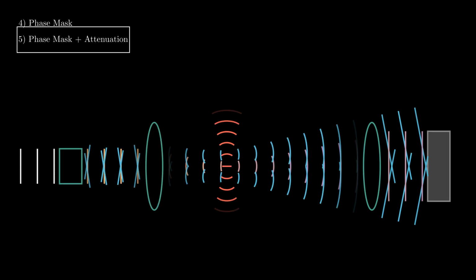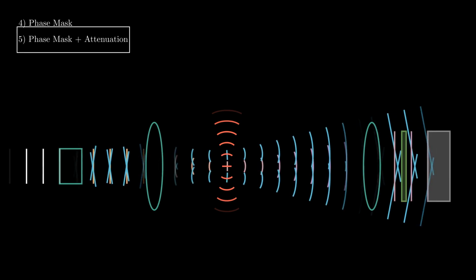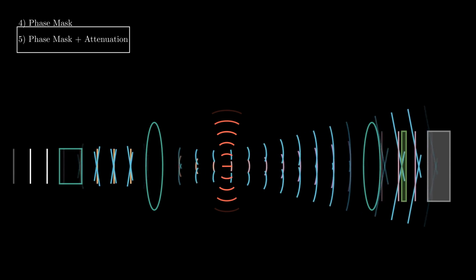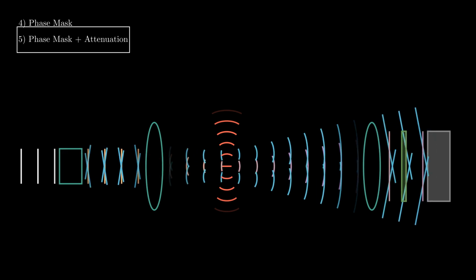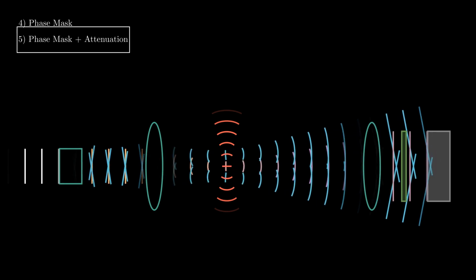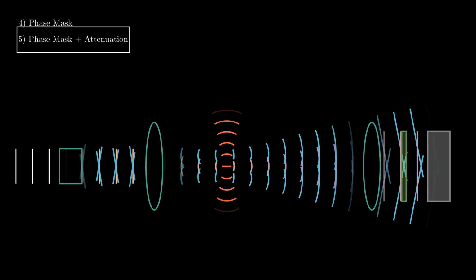But can we do better? Due to camera technology limitations, we can further improve the quality of the image by not only delaying the unperturbed component of the wave, but also attenuating it and darkening the background of the sample. Luckily for us, there is an energy filter in the microscope that knows how to throw away electrons with different energies than the original electron energy. If we could only give or take some of the energy of the unperturbed wave, it would be filtered out later by the energy filter. The current setup does not add or take energy from the electron, but only delays it.